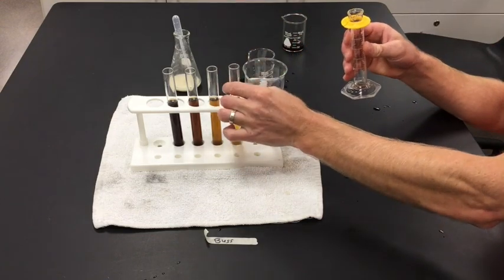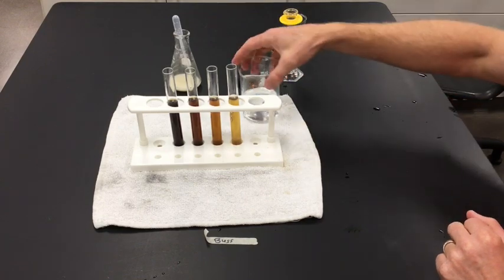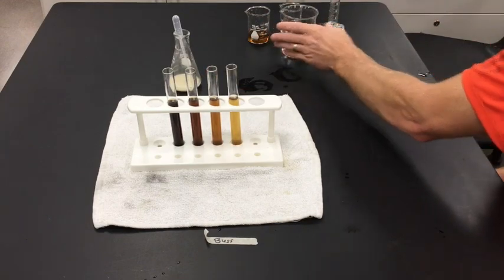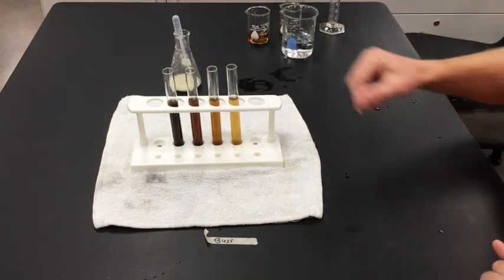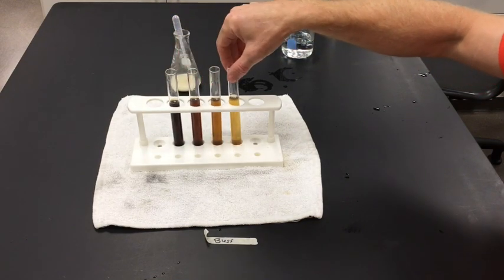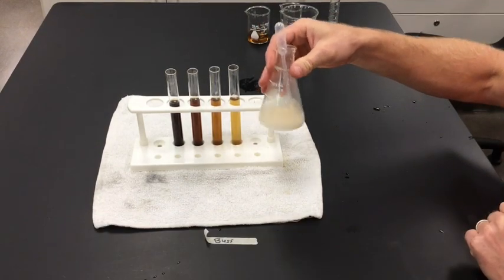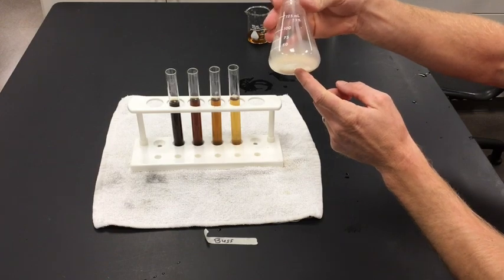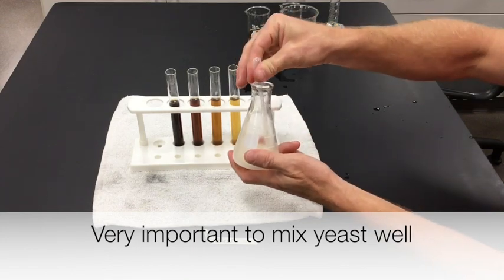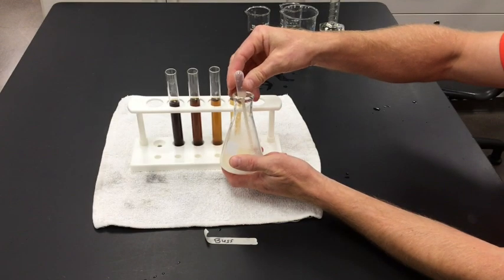I've made my dilutions and I'm done with the graduated cylinder and beakers now — let's move them off to the side. Here I have my four concentrations: 16%, 8%, 4%, and 2%. Now I need to add the yeast. I'm going to swirl the yeast because it tends to settle on the bottom. I'll take my pipette and add yeast — 10 drops to the first test tube.